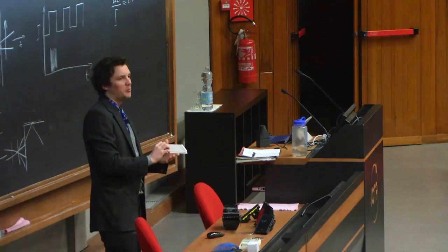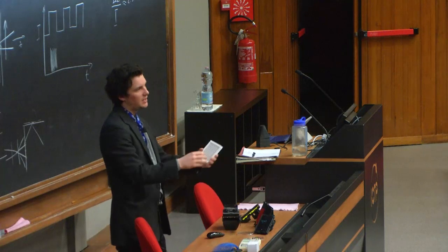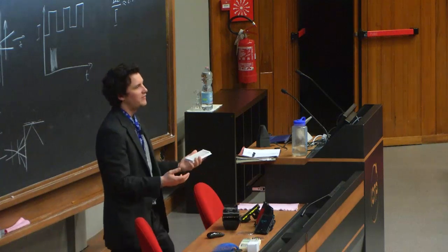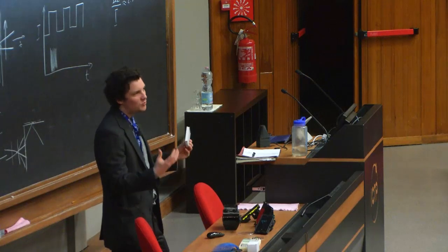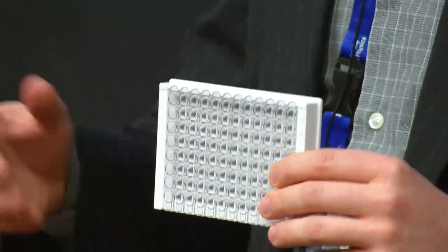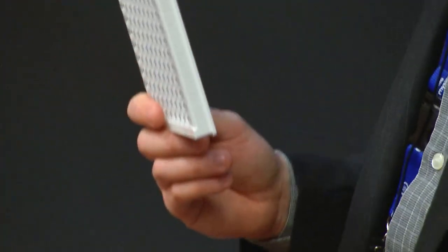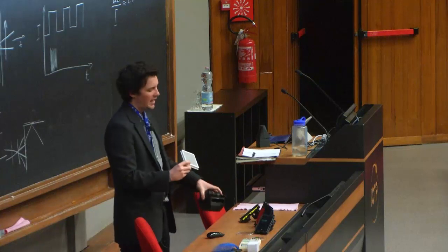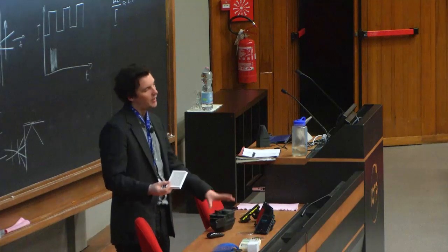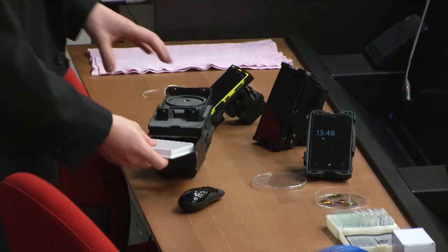ELISA well plate readers are benchtop machines that are maybe this big, and they're obviously very effective at what they do. As they're everywhere in the world in well-funded clinics, they're designed to be modular for many different ELISA tests. However, we've designed a device that is for one specific ELISA test, so it uses one specific illumination and can be read with a mobile phone. So I can show that to you as well.